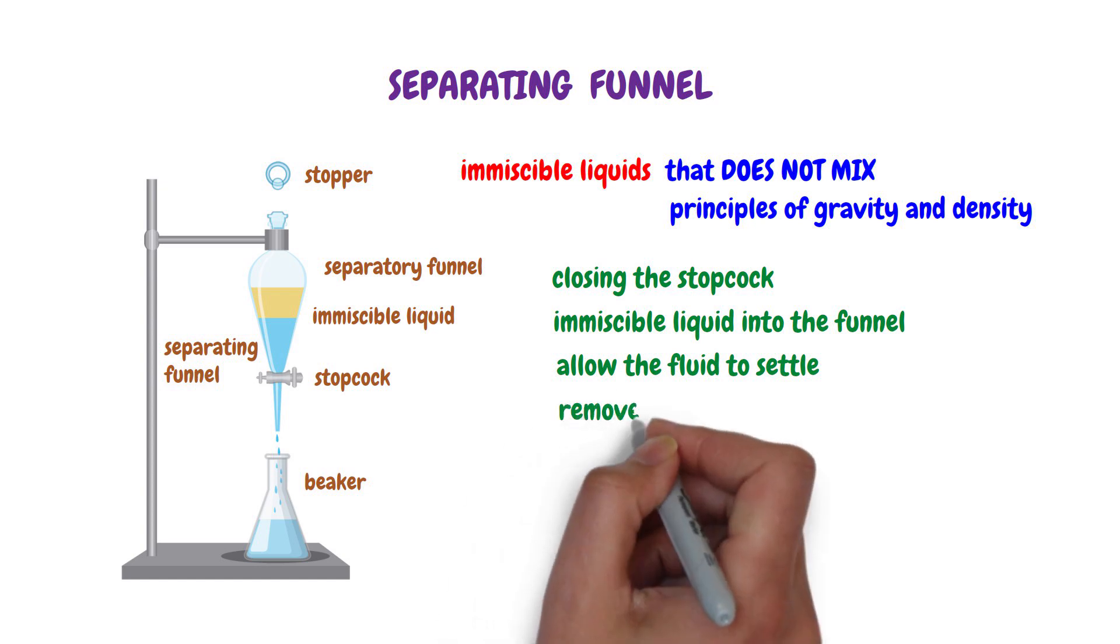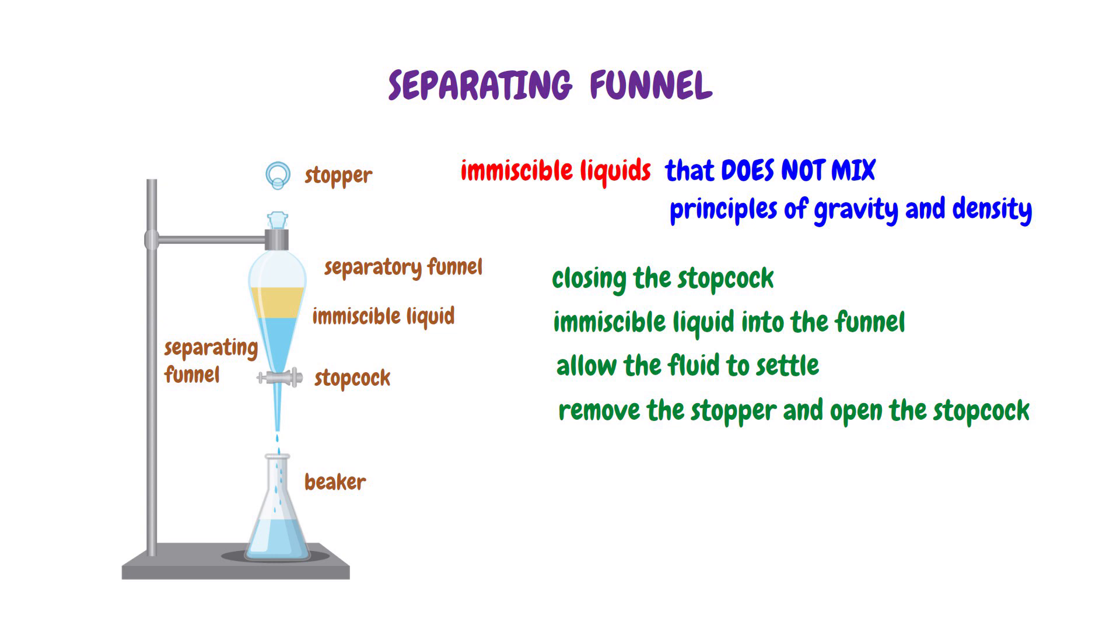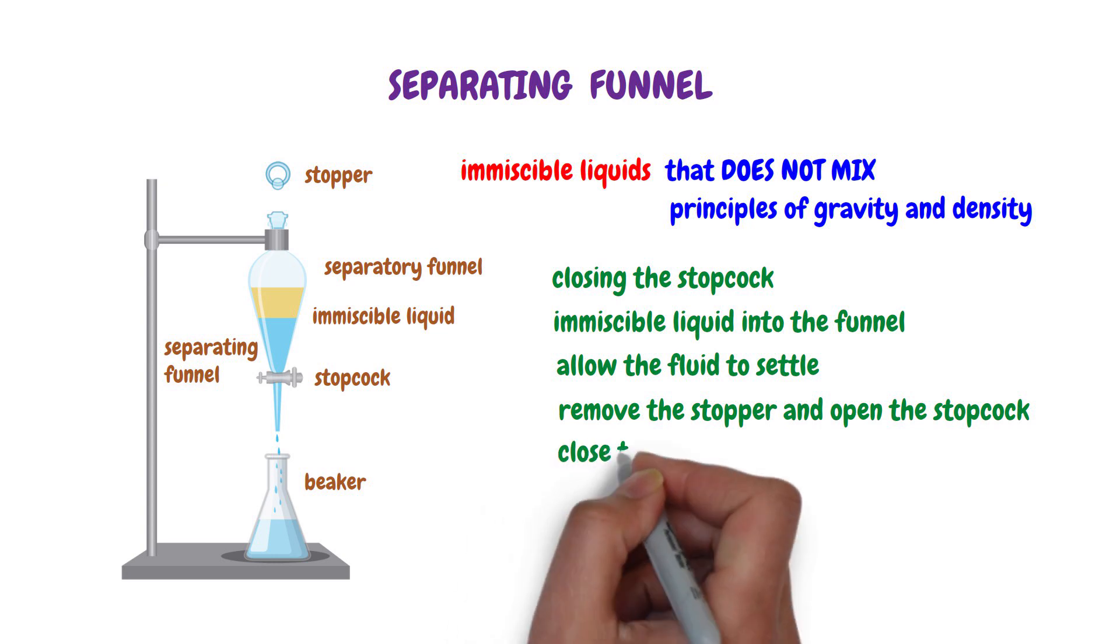To effect separation, remove the stopper and open the stopcock. This allows the denser liquid at the bottom to flow out. Once the desired amount of the denser liquid is collected, immediately close the stopcock.